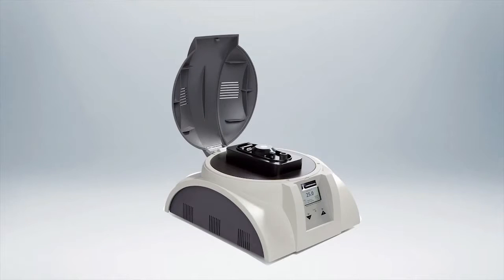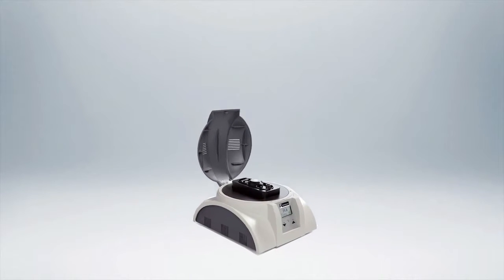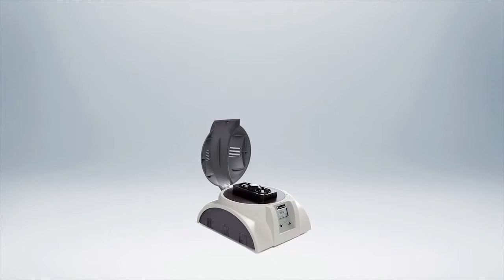The Vasco product line is available in two different versions in order to cover the broadest range of application and match your budget. Vasco 2 is equipped with a low-noise photomultiplier sensor for standard applications.